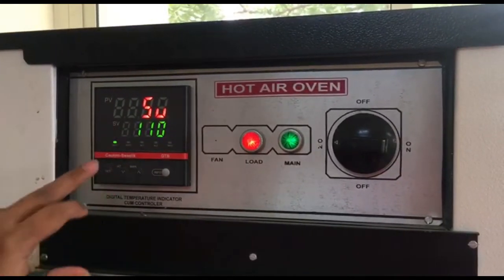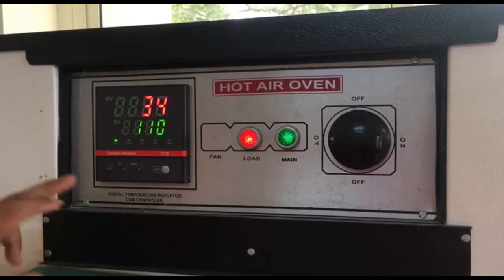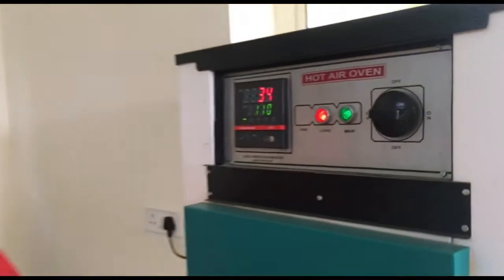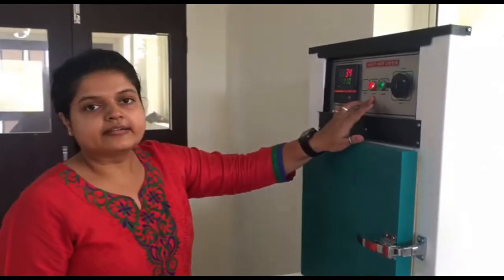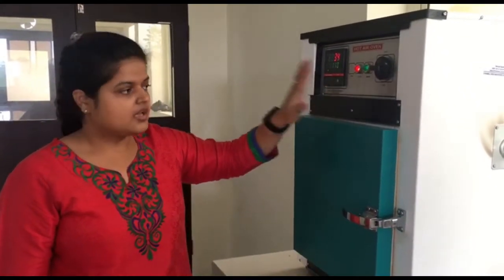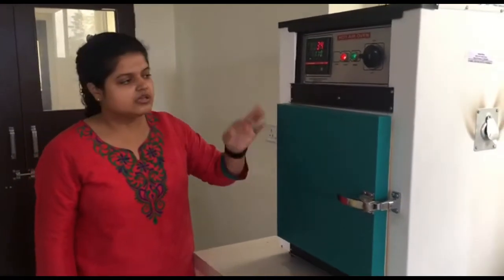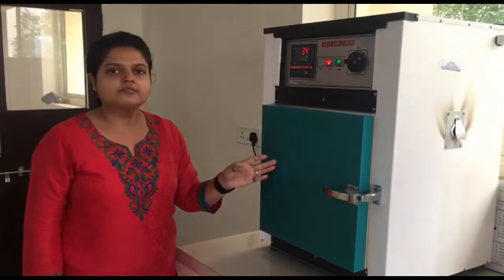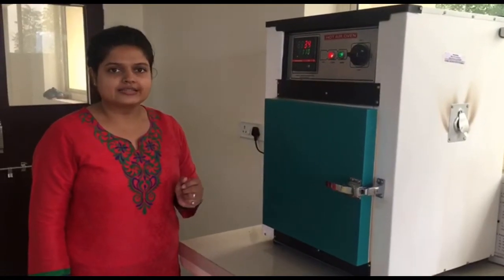If you reach your desired temperature then press the set button again — this sets your temperature. This red light indicates that heating has been started. Now if you look over here you will find that this is called the jacket of the oven, which is made up of glass wool.